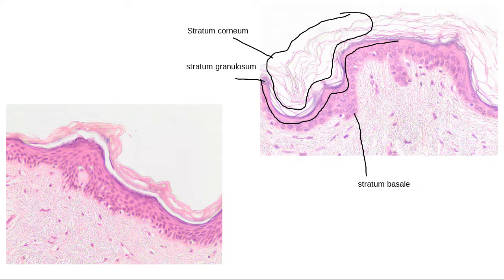So new skin, and it's just one layer of cells. So anything in between this bottom layer and this purple layer is where we would call it stratum spinosum. Stratum spinosum can vary in size depending on where you are, if we're at the top or the bottom of a dermal papillae. But we've got stratum spinosum in between stratum basale and stratum granulosum.